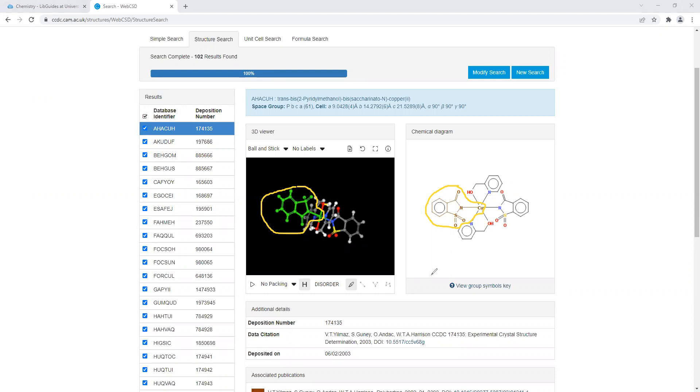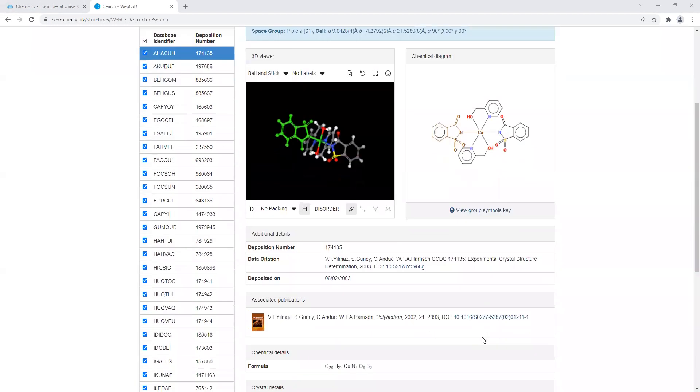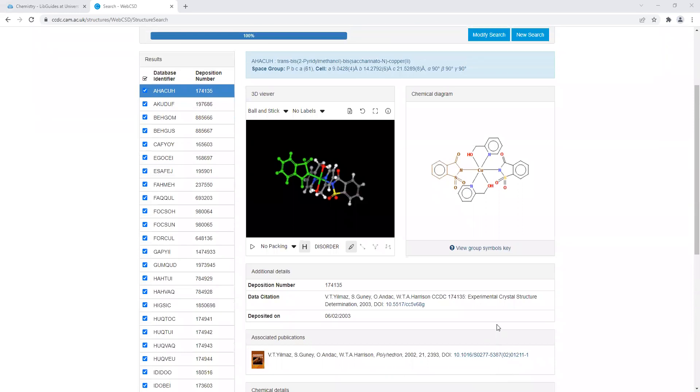If you wanted to, you could use this structure as your structure for your lab report. Now just bear in mind that if you want to use it, if you scroll down to associated publications, you click on the link. If our university has access to it, you can download the article.